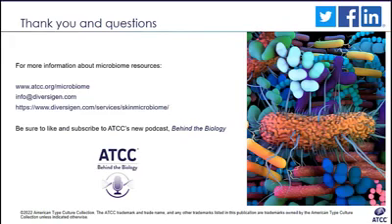Similar to including a mock community, shouldn't studies also include blanks and environmental samples to capture contaminants? And do you subtract these out in your normal samples in your pipeline? Yeah, that's a very good question. So ideally, as I mentioned, you should include the blank control at the beginning of your pipeline, from the moment you extract the DNA from your skin samples, just to make sure that there are no contaminants from your reagents or the primers or water. So always add the blank control.